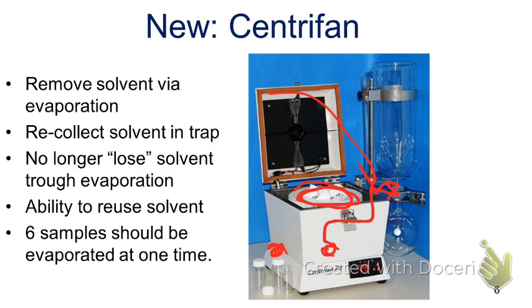Okay? And if you look very, very carefully underneath what I'm now drawing over, there's a little finger, is what we would refer to it, aiming down into that glassware. That will be filled with something very, very cold, either ice water or dry ice and acetone, so something that's ridiculously cold. Okay? What happens when our vapor gets near that cold? It liquefies. Okay? And it will drip and collect down in the flask underneath. Okay? So now we've collected it.